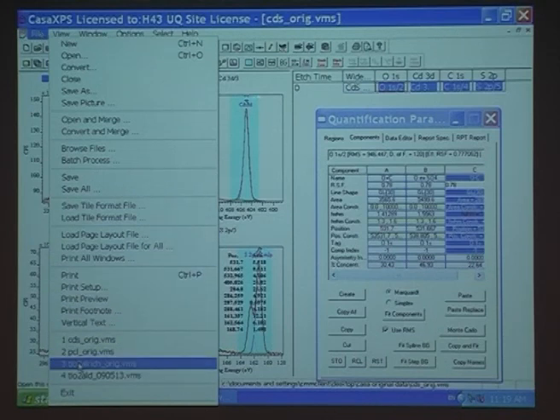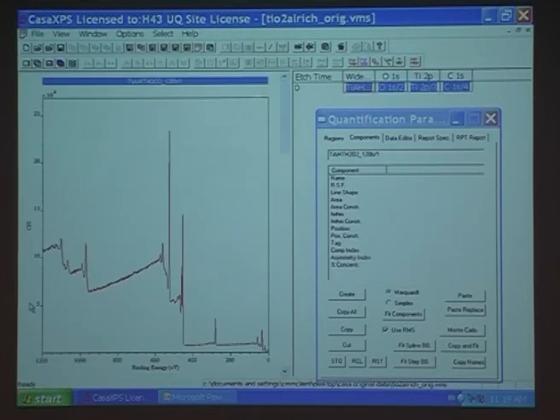And here's some titanium dioxide from Aldrich. I don't know, 99.9 something percent pure. Now, all titanium samples are very reactive. I never see clean titanium. I see very clean silica. You take silica powder, heat it up to 800 or something. Carbon, I can hardly see it in the survey scan.